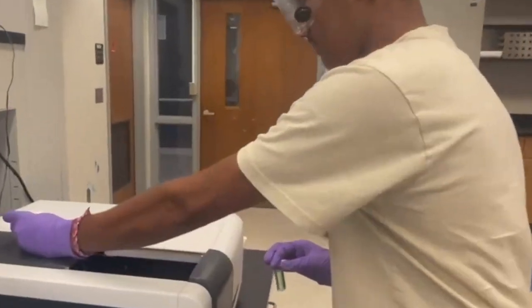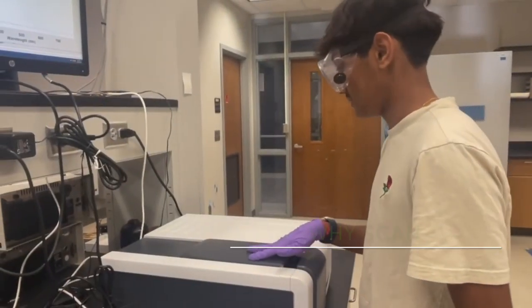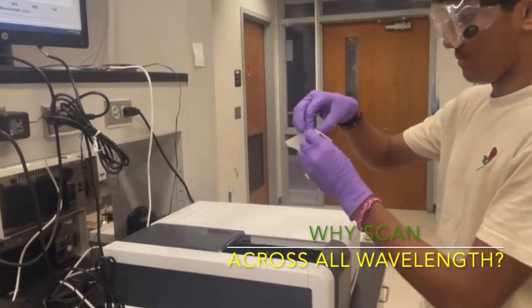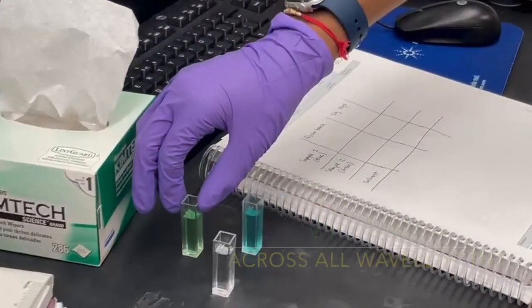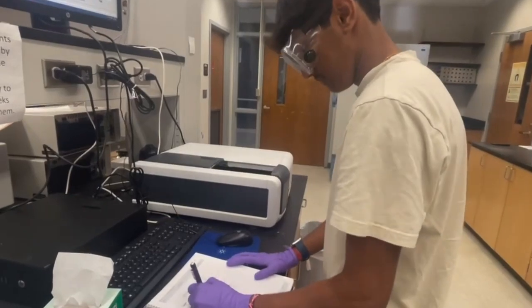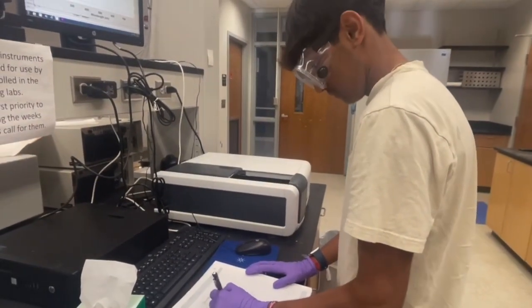You should scan across all wavelengths in a spectrophotometer because different compounds absorb light most strongly at different wavelengths. So by scanning across the spectrum, you can identify the specific wavelengths where a substance absorbs the most light, which helps in identifying the compound and analyzing its concentration.